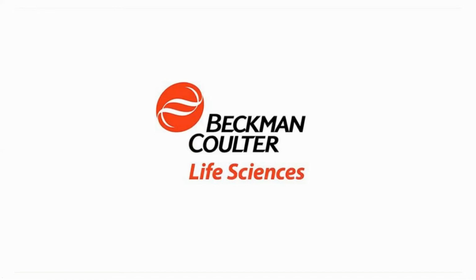We've been trying to ease some of that for our scientists. For the Skylines, for example, we have lab support staff who are able to preload the Skylines with the QIAGEN 96 kit filter plates as well as tips. We have extra racks for the Skylines that we keep preloaded on the side of the system. So when our scientists need to run the system, they can come over and pop those on rather than unpackaging all the consumables and loading the towers themselves.